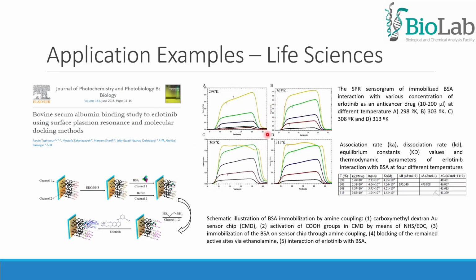Here we can see the dose response sensorgrams at different temperatures, and based on that, the kinetic and thermodynamic parameters of the interaction were calculated.